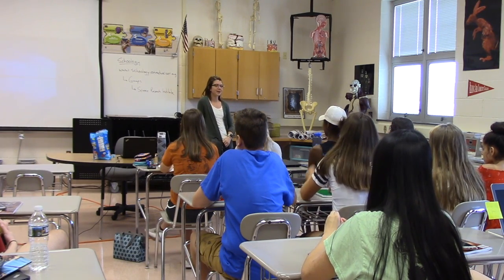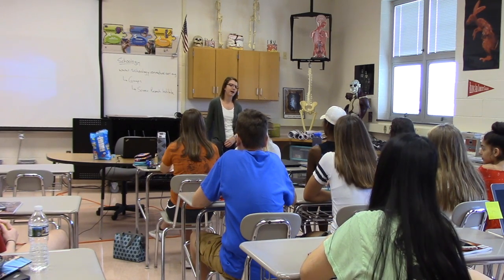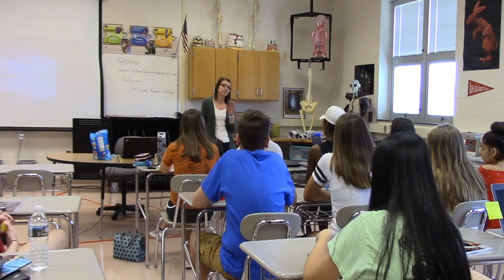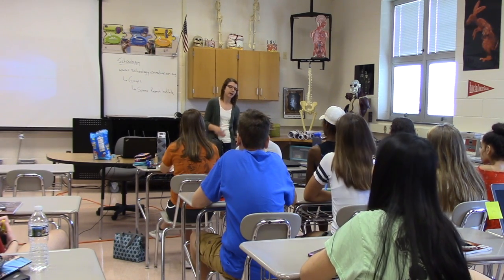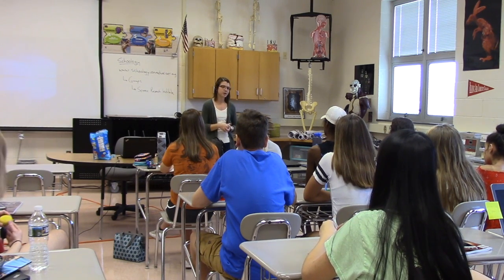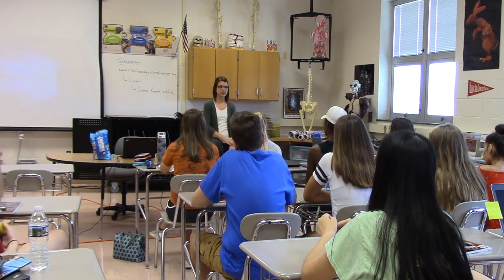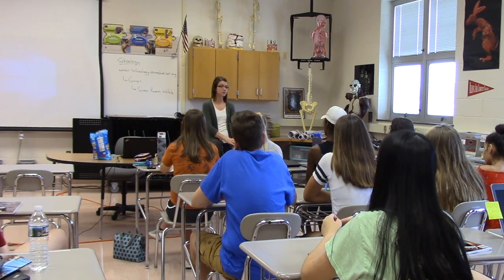Okay, so we have 12 biosafety cabinets in our department alone. And every technique that we follow is written out in a method, and we have to follow stepwise what that method says. I don't know if you guys do this, but we actually have to wear sterile gloves and sterile sleeves. Do you guys do that?